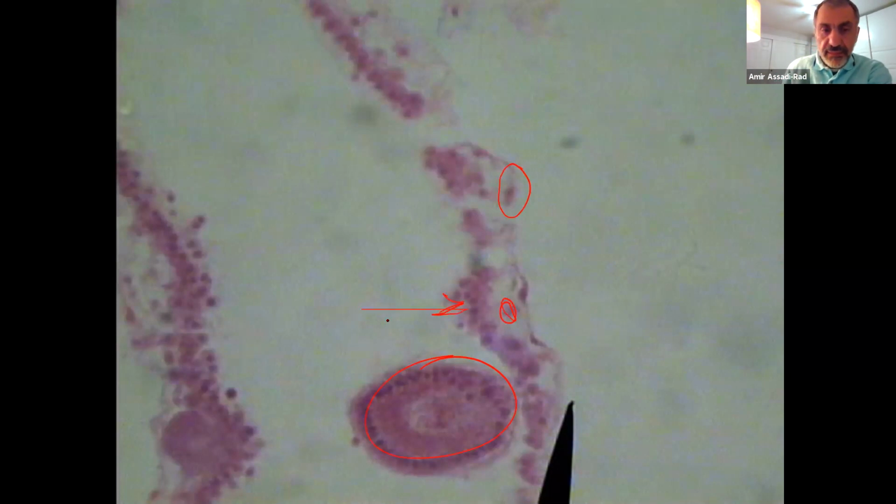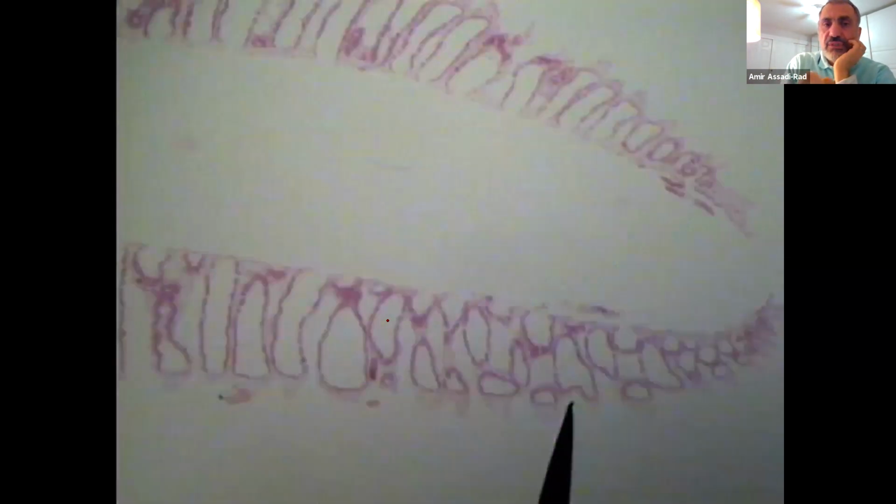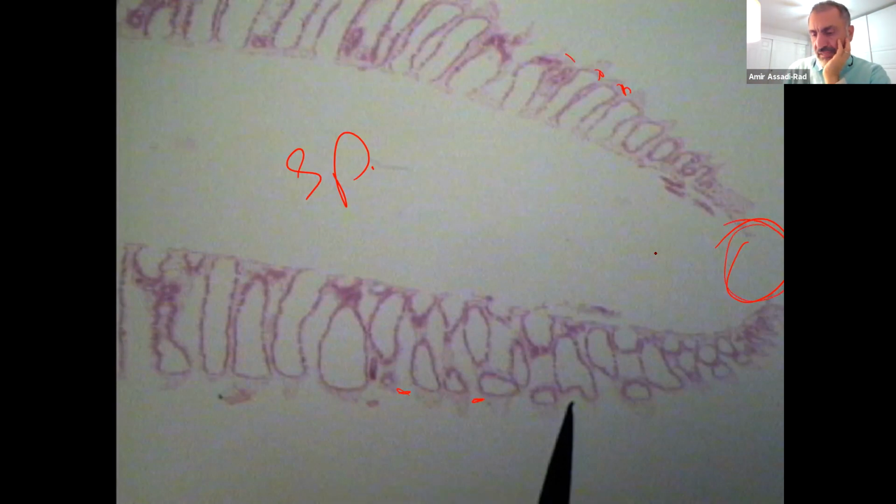And that would be your radial canal. And then spongocoel, of course, and right here is osculum. These are ostium here, right? These are ostium, but this thing is osculum. Same organism. What class? Class Calcarea, phylum Porifera.